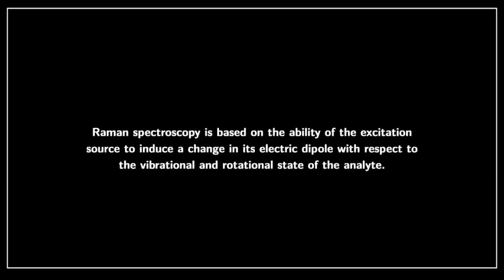Good. So to summarize what we've done so far, Raman spectroscopy is based on how we can measure how the excitation source induces change in the electric dipole. I really need to insist a lot: what matters here is the change in electric dipole.